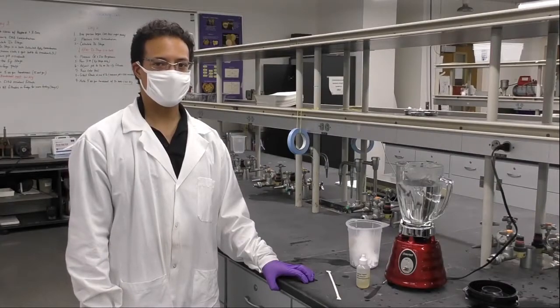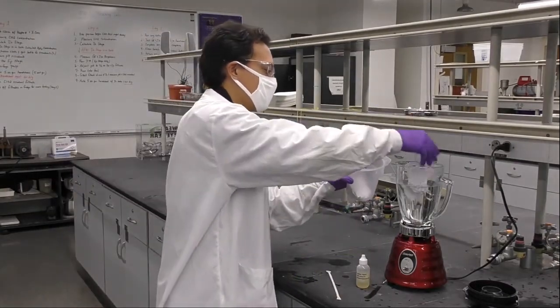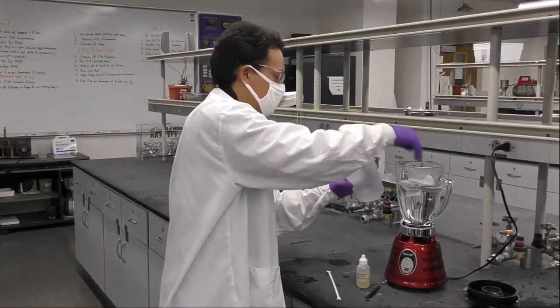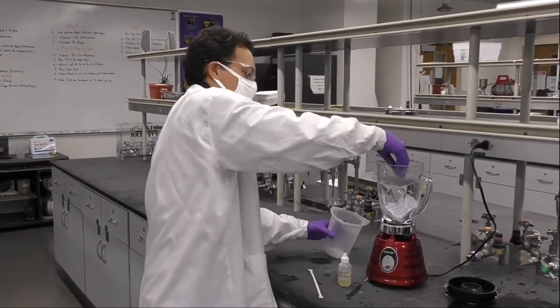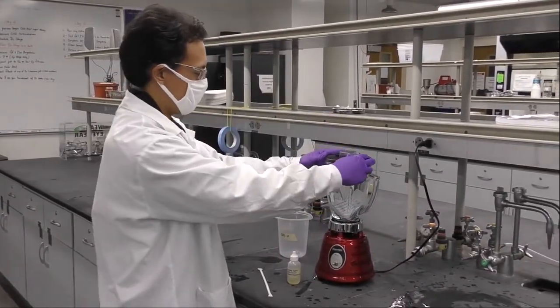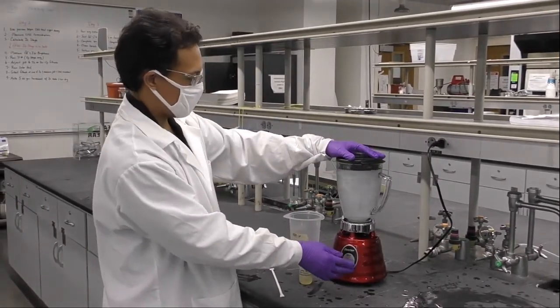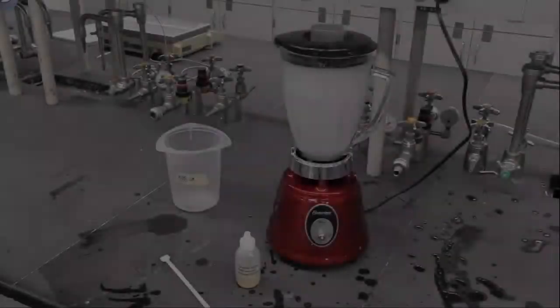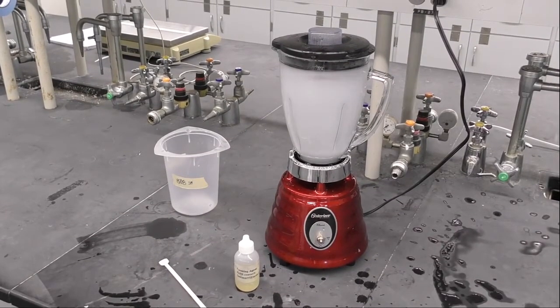Now we need to put our torn paper into the warm water. Make sure that you remove your fingers first and then you can cover the blender and you will stir the paper with the water for 45 seconds. Once again, we are blending the recycled paper with the water for 45 seconds.